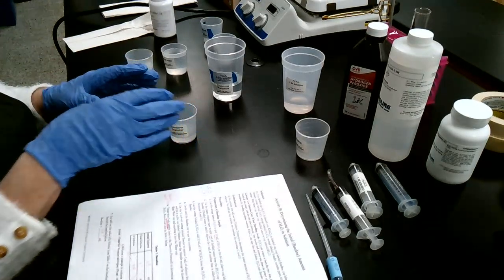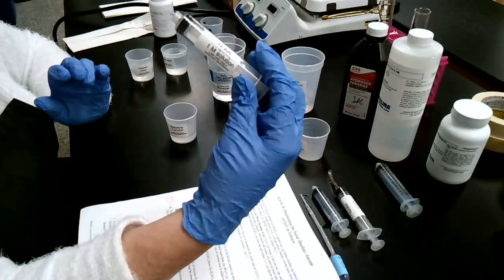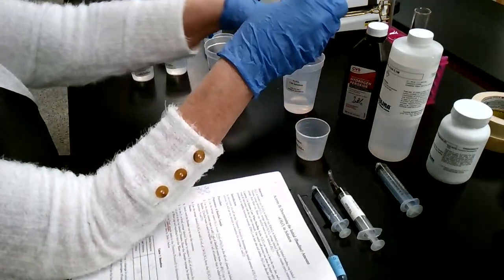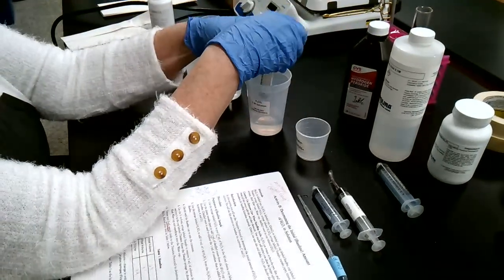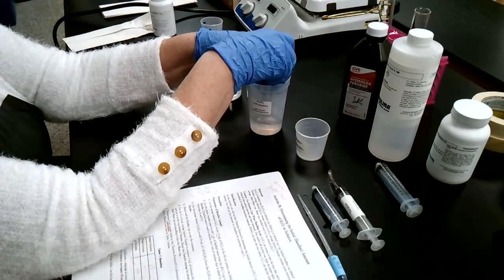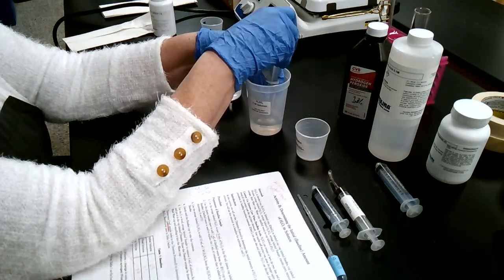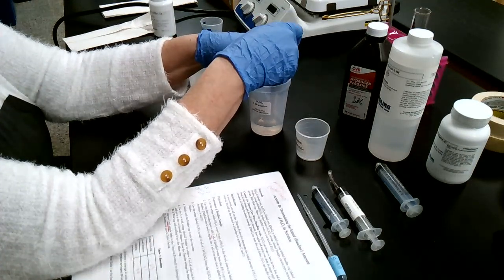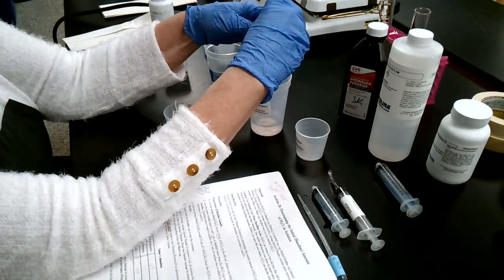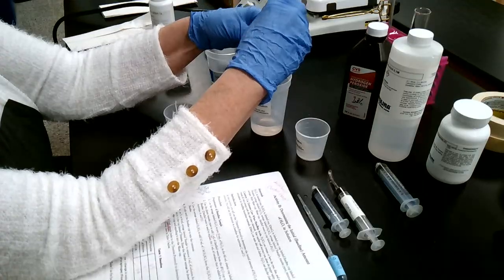And after that happens, you've got to get ready, because this is when you need your sulfuric acid. You're going to get 10 milliliters of sulfuric acid. Now, this is acid. This is pretty nasty stuff, so try not to get it even on your gloves. But you're going to bring up a bunch, and you might even want to have this ready before you even start your countdown. So I brought it up past the 10. I'm going to squirt it down to the 10, so only 10 milliliters goes in there.